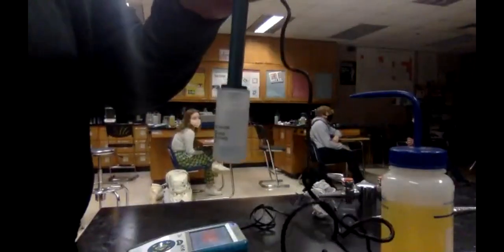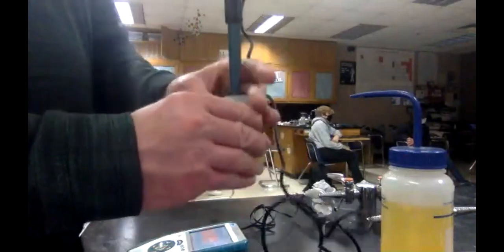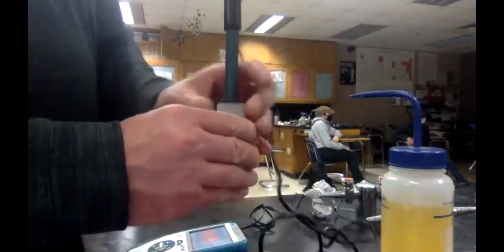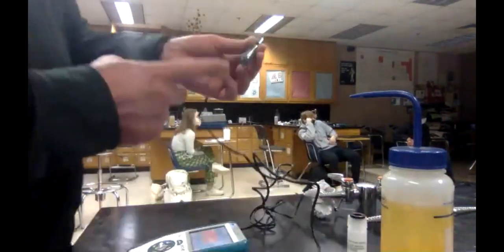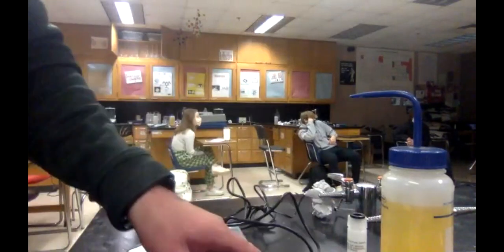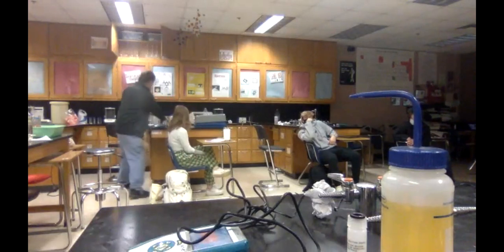This is the probe. This is the hardest part of this whole thing. You unscrew this, and then you can pull the probe out. This needs to set facing up because it has a solution in there that protects the probe. Let me grab these two solutions over here real quick.